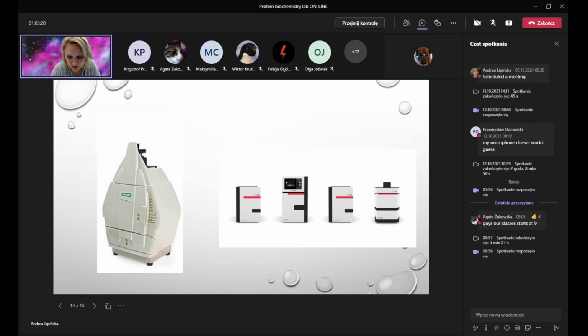Okay, and for the transfer, we use a similar buffer which also contains Tris and glycine and SDS. There is methanol added to increase the heat capacity of the buffer, because there may be just high current going through the sample, especially in semi-dry blotting. So semi-dry blotting buffers are always with methanol, just to prevent heat from damaging your membrane, even though sometimes it happens that you get a yellowish membrane after the transfer.